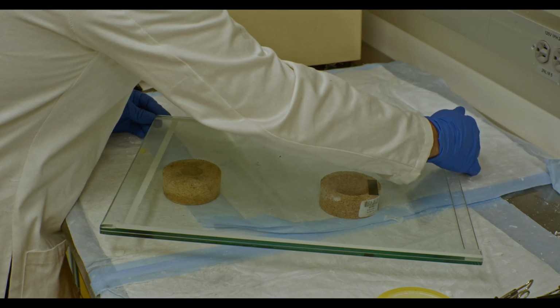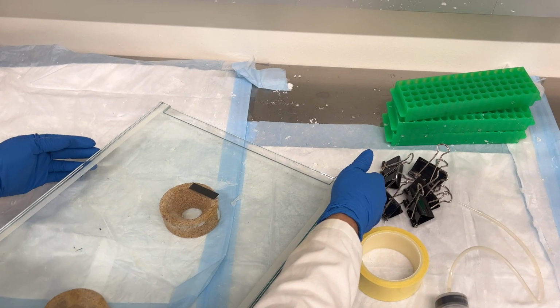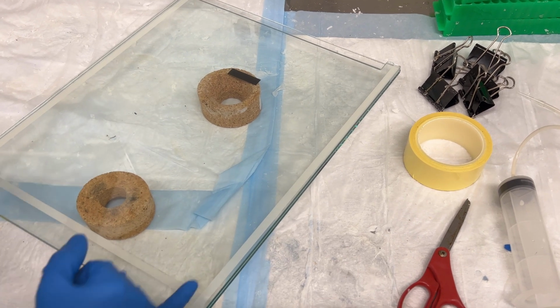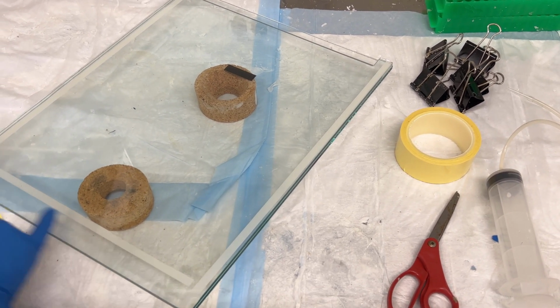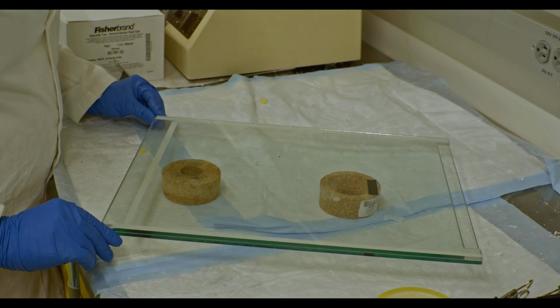So if you have to move them ever so slightly, you can. But I'm just trying to make sure that the spacers are as even as possible. And you can see that there's some space right here at the bottom so that some gel material can go here, form, and be able to pull a nice and even current across the gel so it doesn't overheat.